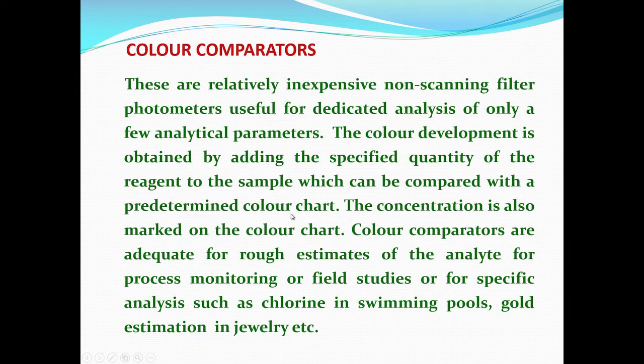If you can prepare a series of standard solutions and look at their color, and then take an unknown and the color falls in the range, you yourself can approximately estimate the concentration depending upon your experience. So, you convert it into an instrument-like measurement of color with a barrier layer cell, a small LED and a simple glass filter, and they become the low end instruments.